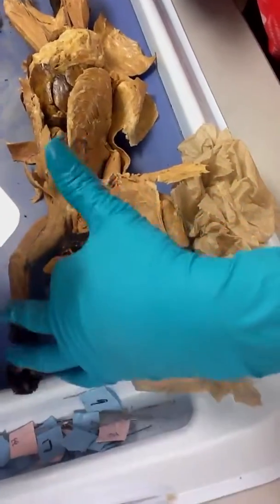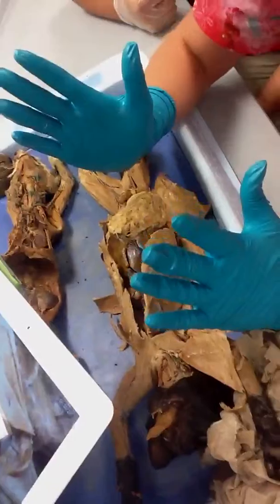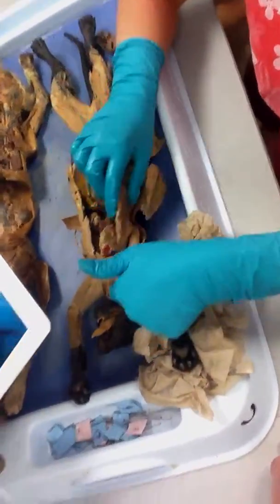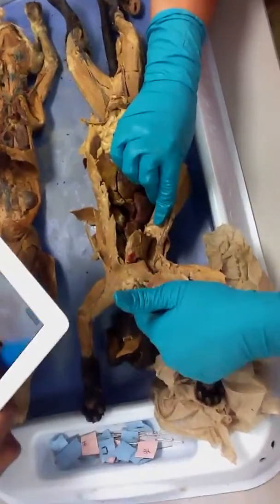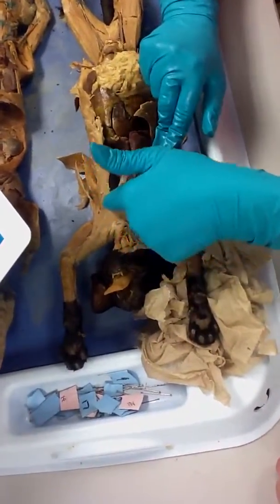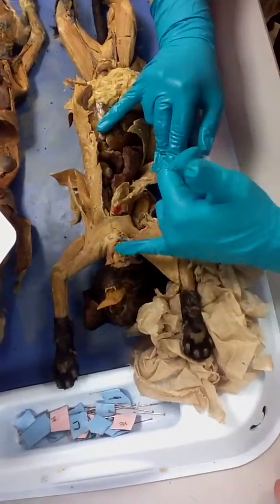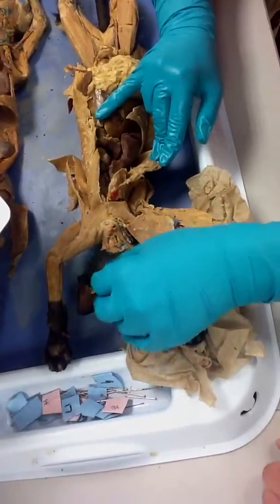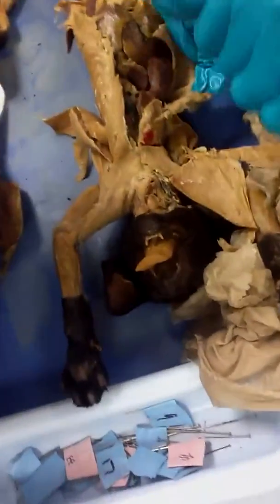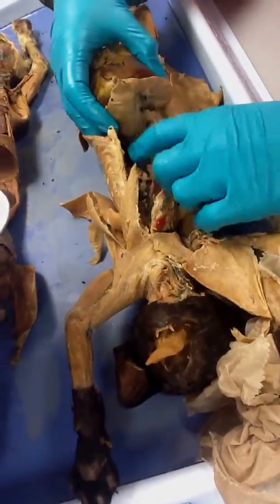Okay? Food comes into the mouth, and then we have our epiglottis that will cover the trachea, so food goes down the esophagus. Smooth muscles will, through peristalsis and segmentation, take the food down to the abdominal cavity. So the esophagus is really what connects the front end of the digestive system with the rest of it. Okay, it's the only thing other than the vena cava and the aorta that transects through the diaphragm.